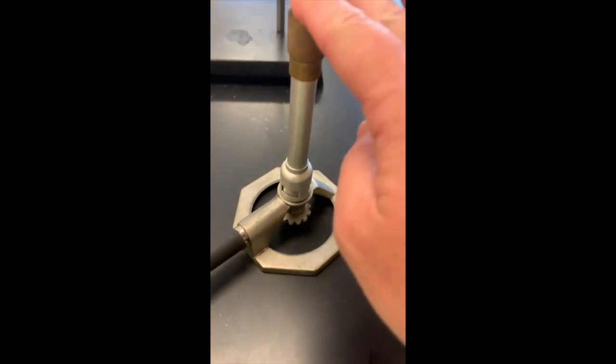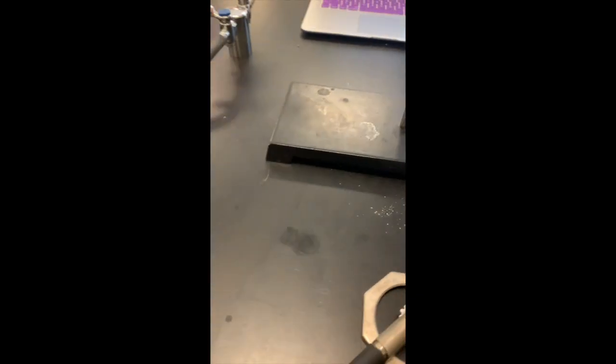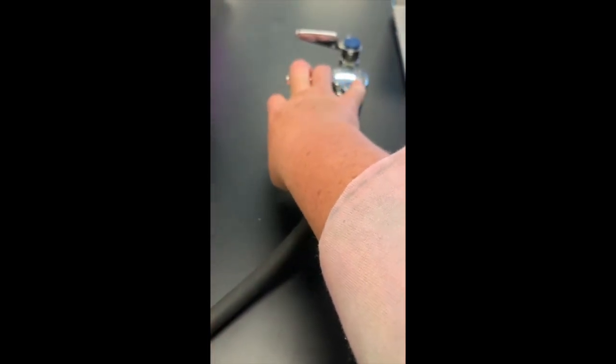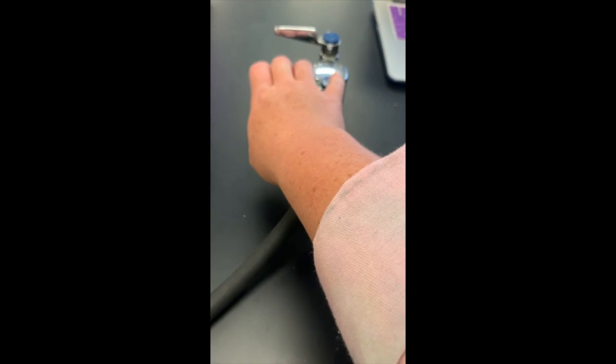This will allow the gas to flow out through the top of the nozzle once we turn the gas on. This is not the main valve for the gas. If the gas doesn't come out, that's because the main valve is not on.